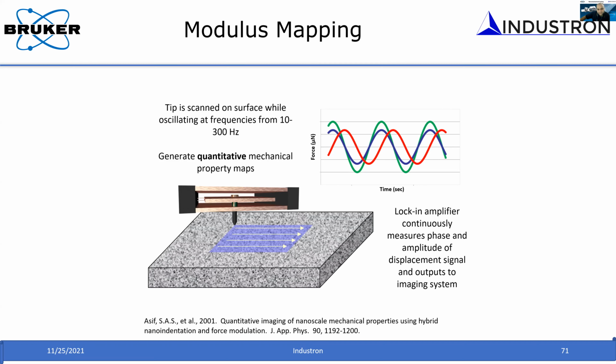In case of UTM, we can get the average value of elastic properties. Comparing this with nano indentation, we can get the properties of each different phase of a multi-phase material. So how can we compare nano indentation to UTM? For example, let's say you have a multi-phase material, and you are doing like 1,000 indents. Those 1,000 indents cover both the phases. Let's say you have 2 phases. In a square array, you're doing 1,000 indents, which covers 2 different phases.